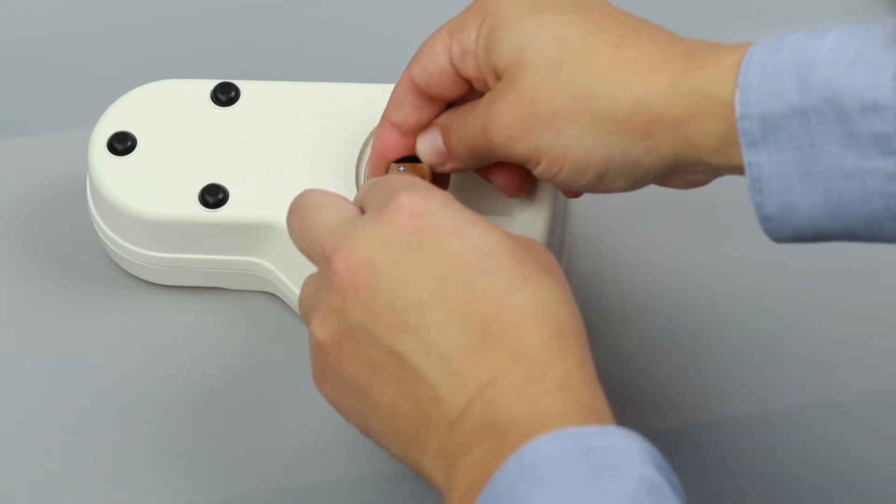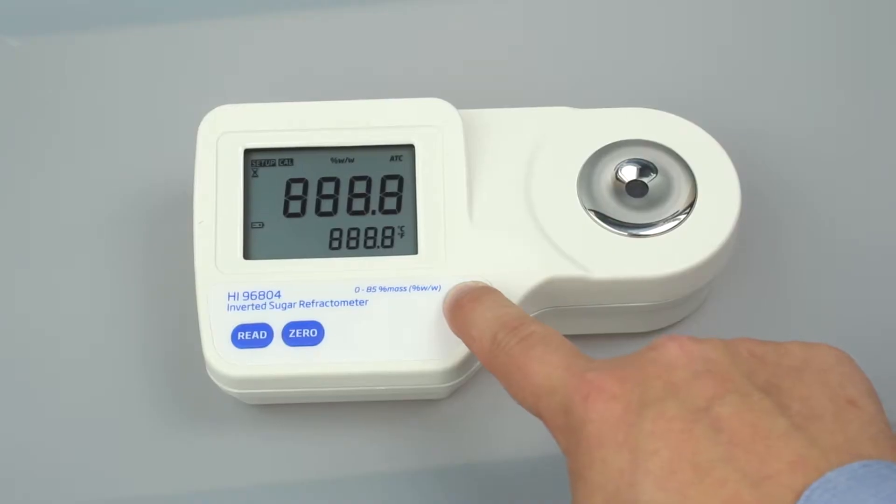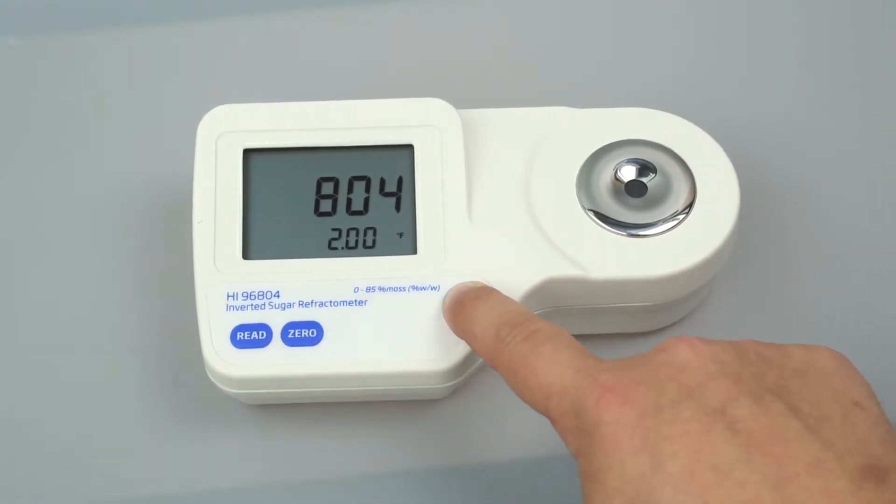To set up your meter, install the 9-volt battery in the compartment. To select your temperature units, press and hold ON-OFF until the screen flashes. Continue holding ON-OFF and press 0 to change from Celsius to Fahrenheit. Once you have set your units, the refractometer is ready to be calibrated.